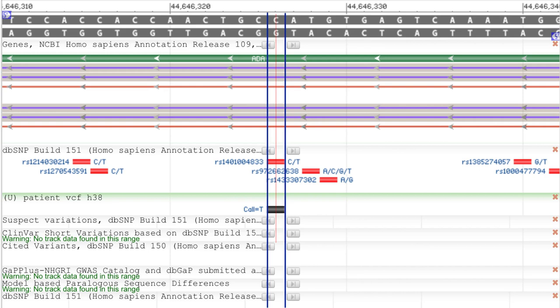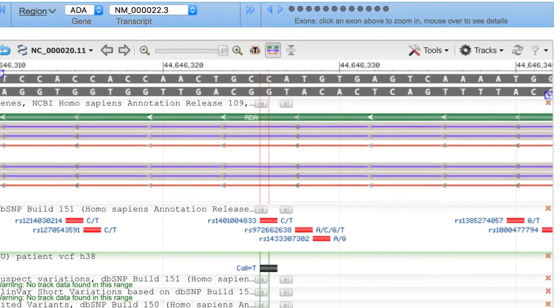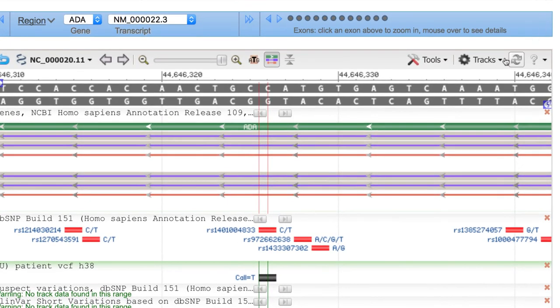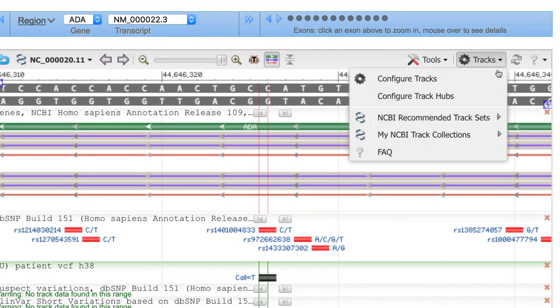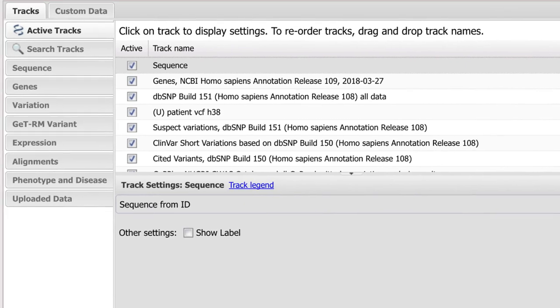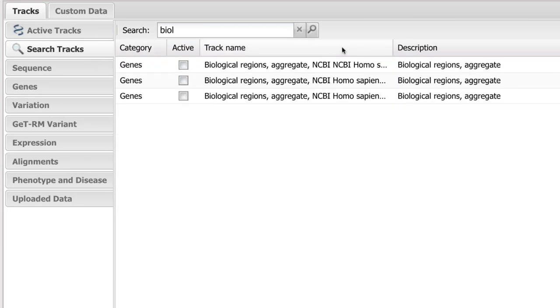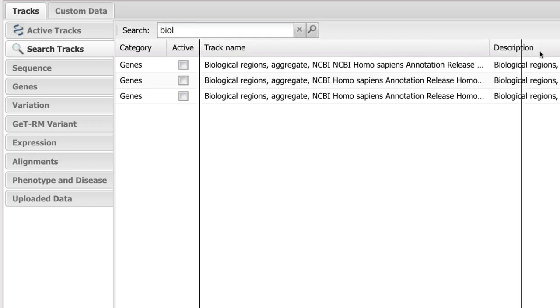We can find that by searching within the Configure Tracks menu. After searching for Biological, I'll select this first one.